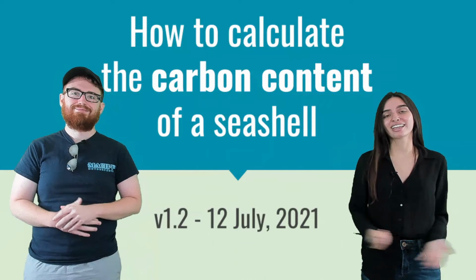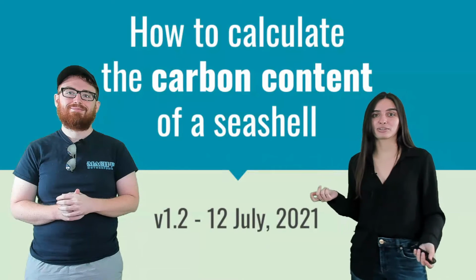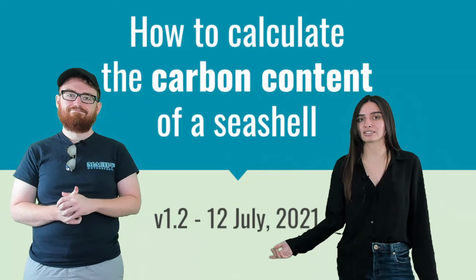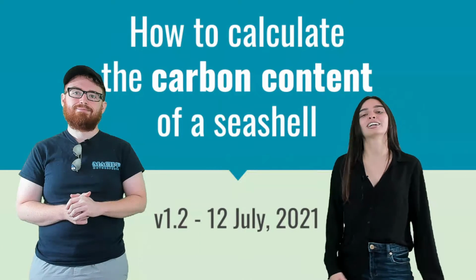All right. Hey guys! So today, Jordan and I are going to be showing you all how to calculate the carbon content of a seashell based on this lab we did. Jordan went ahead and made this sheet where you can input your information. It just makes your life a lot easier, so let's get into it.